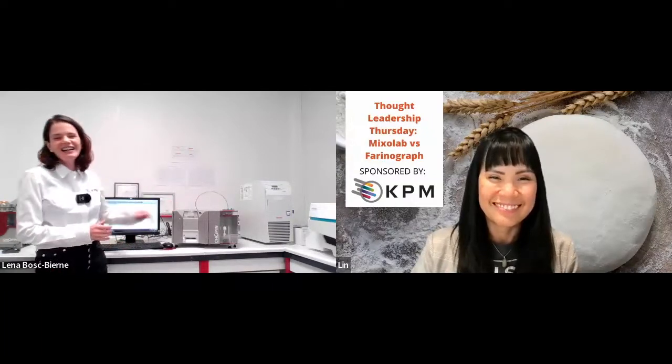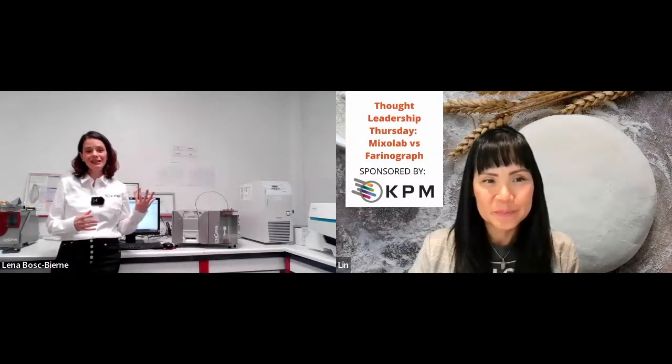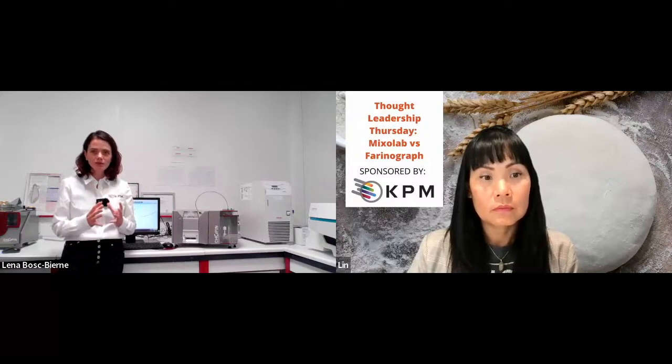Right. So some bakers may ask, what are some of the biggest differences they should be aware of between the Mixolab and the Farinograph? That's a very interesting question. As you can see, first, the design is clearly not the same. No, I'm kidding, of course, but the biggest difference is that the Mixolab is able to heat and cool down the dough. This allows us to observe during the same test not only the protein properties, but also the starch properties, the enzymatic impacts, and the interactions between all of those components.